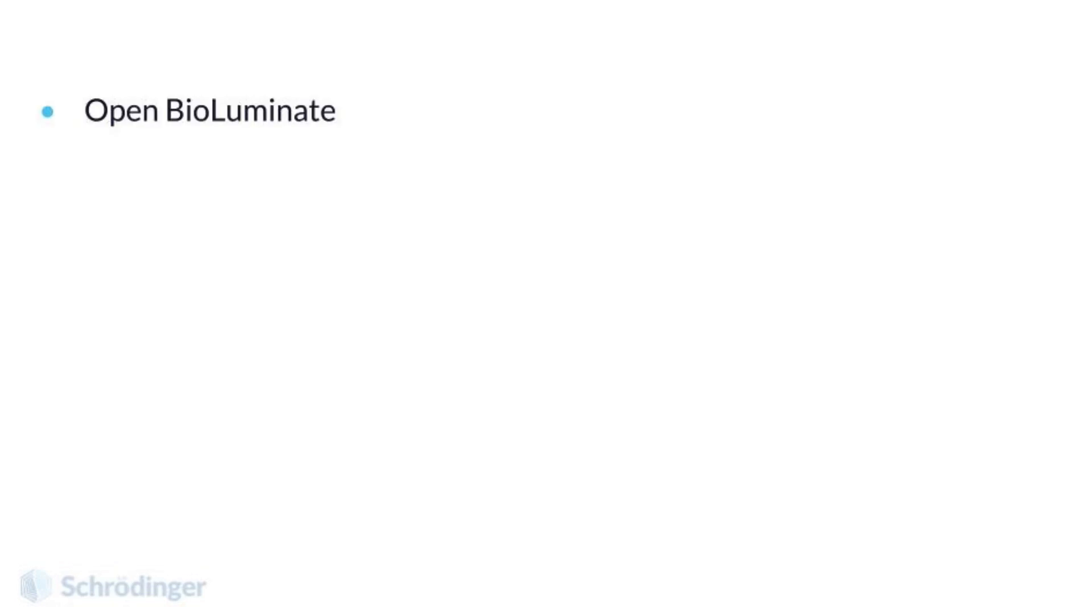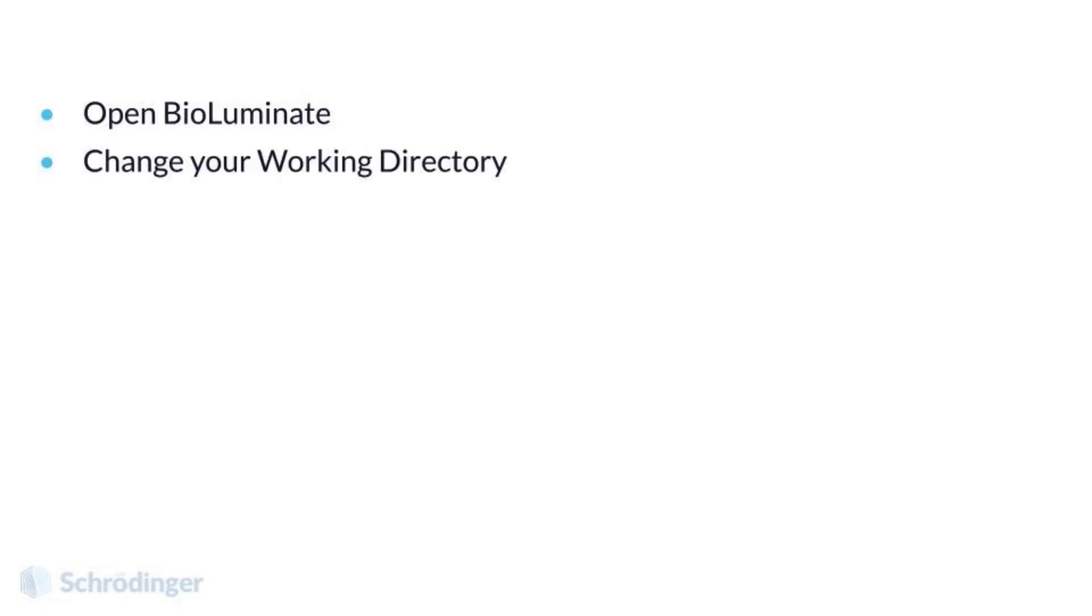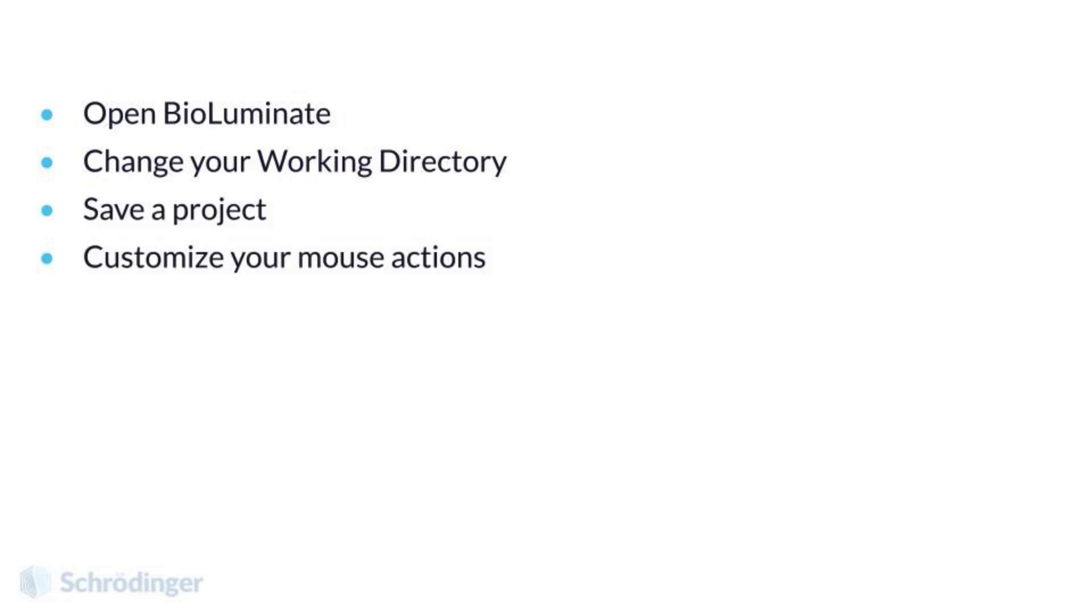Hello, and welcome to our video introducing you to the BioLuminate interface. After this video, you should know how to open BioLuminate, change your working directory, save a project, and customize your mouse actions.